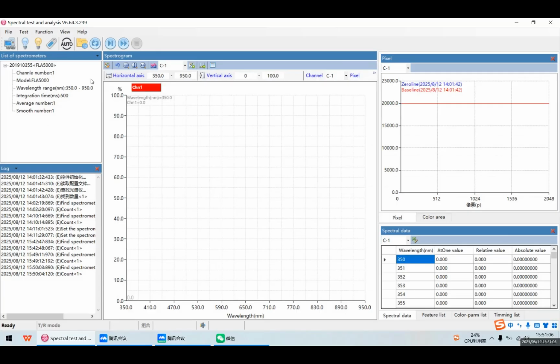It is necessary to perform the operation of taking the background and making a reference. Background picking refers to removing background light or dark noise. To make a reference is to put the reference object in, such as air or clean water, as the 100% test.